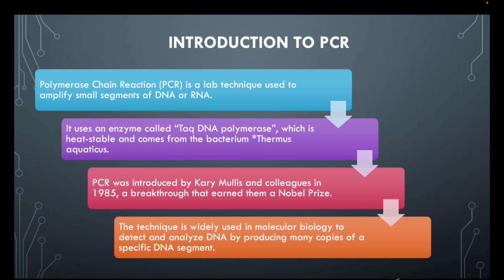and my previous videos in molecular biology and structural biology, PCR is essential in molecular biology. Why? Because we need to amplify our DNA. DNA in very small amount is not sufficient to work with, and in a biology lab you need an ample amount of DNA, let's suppose either for sequencing or other experiments. So here comes the PCR.